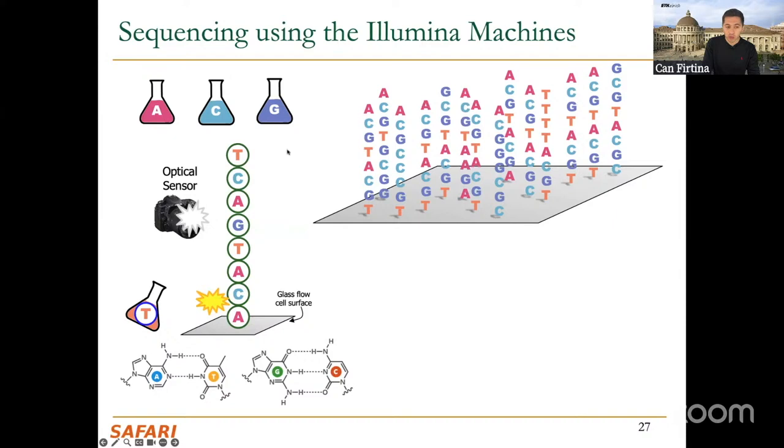and again, remember, you have multiple copies of this DNA, right? The exact same copies. Assume initially we start exactly at the same position. So this means that we have T, and this T binds to the exact same position everywhere in the same DNA. So this means that the T that we're emitting is very dense, right? We can say in a very accurate, confident way, okay, there's a T here. But as we move cycle by cycle, so this is literally done cycle by cycle.